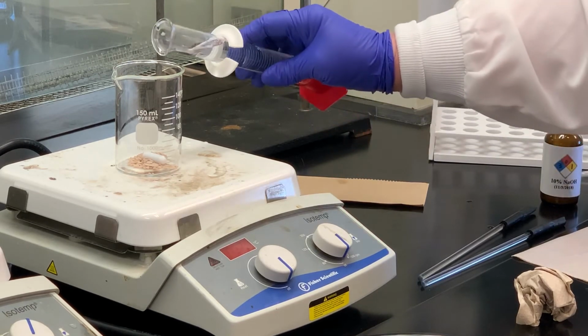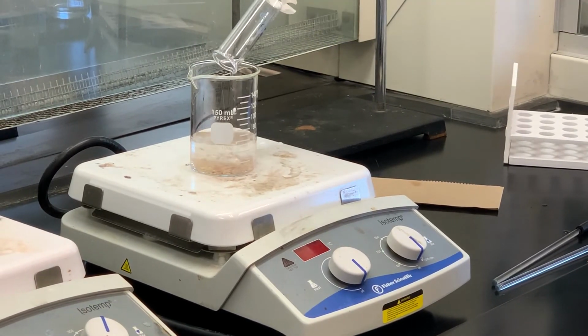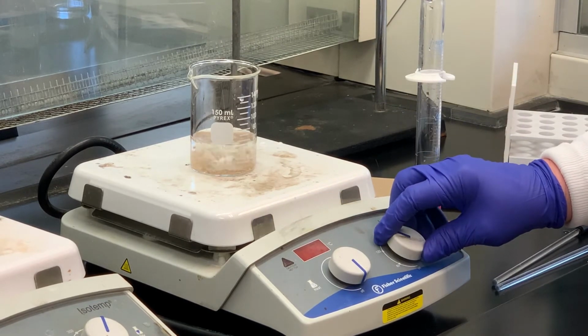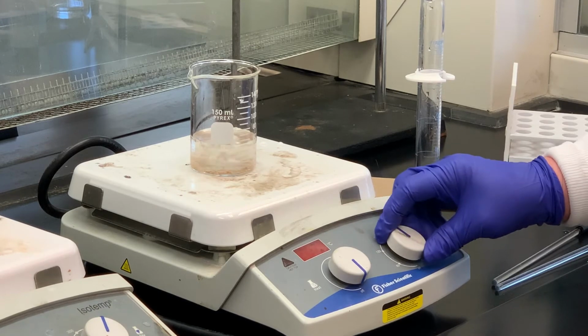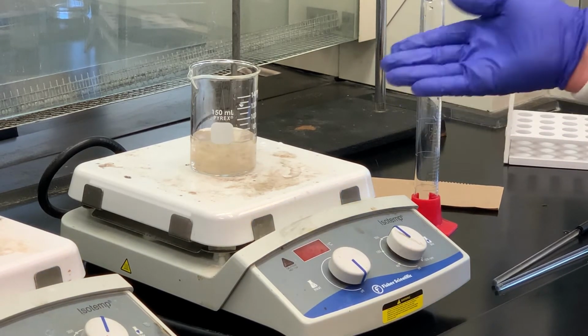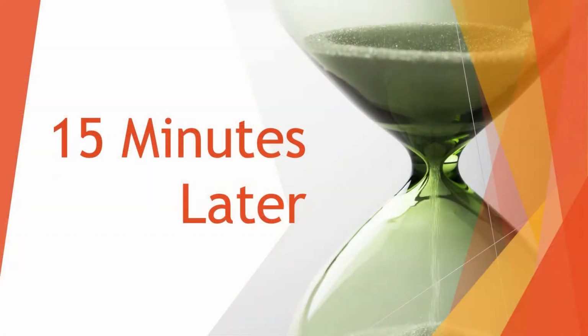So I'm going to add that to the beta-naphthol or 2-naphthol solution, and then we're going to stir that. It's not critical that we chill this down. It's primarily just to protect the diazonium salt, but once we have the coupling component ready and after the 15-minute time period is over, we'll carry out the dyeing process and also make the dye stuff in a test tube.